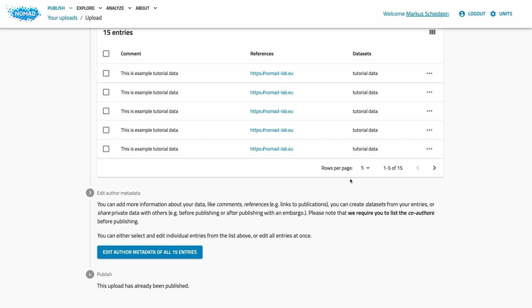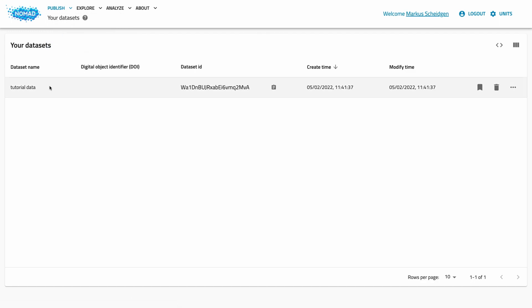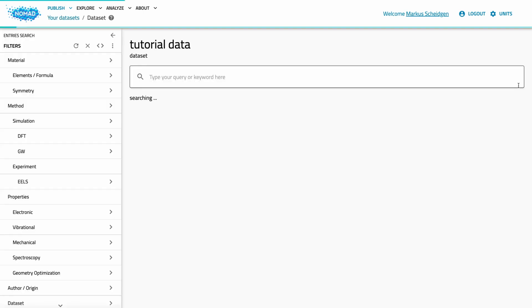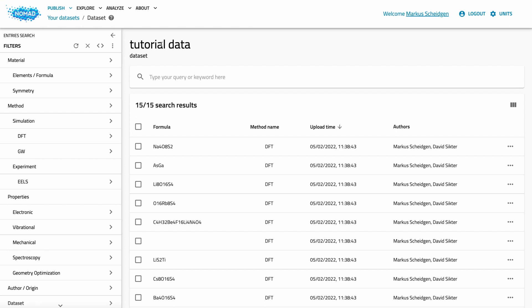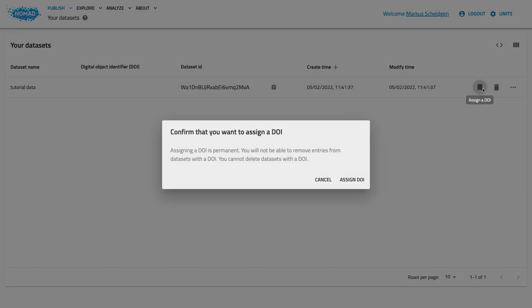This brings us to the last part: how do you reference your data, for example in a publication? The most reliable way to refer to your data is through datasets. We already saw how to create datasets and add entries to them. The datasets page will show you all the datasets that you have created. If you click on our example dataset, you see how the dataset is represented — it shows all the entries and allows searching within large datasets. On the datasets page, you can delete datasets and add a DOI to your datasets. You can only create a DOI for datasets with published data. If a dataset has a DOI, you cannot delete it anymore, and you can only add new entries — not remove any entries from datasets with a DOI.